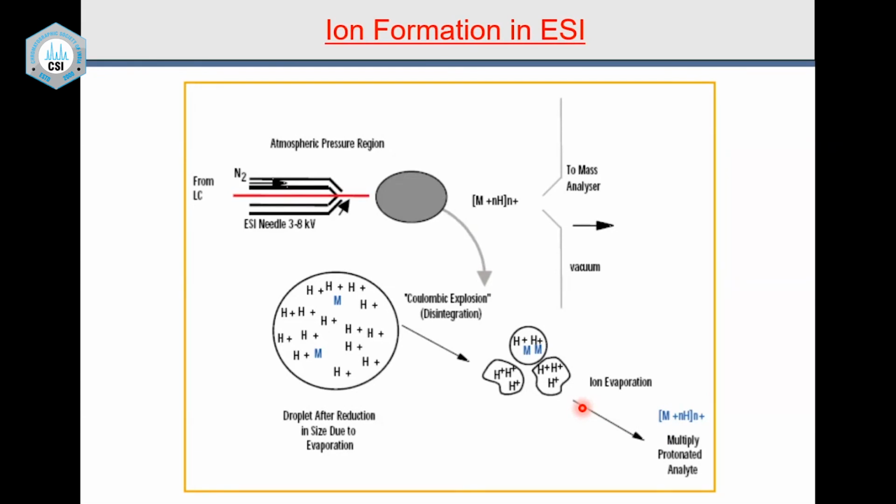And in all those nitrogens, what happens? One proton gets added. They really like to absorb protons, so many protons are added. So you get M plus Hn plus. That means every nitrogen has an H in that. What happens is, I will explain to you, this is multiple charged. So you get multiple charged ions.